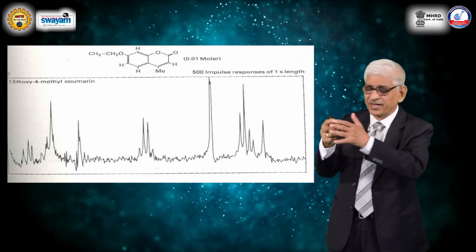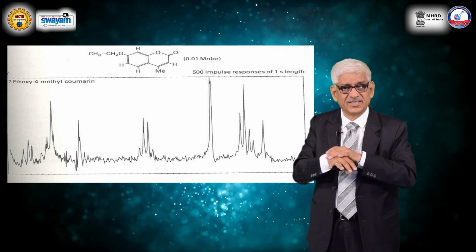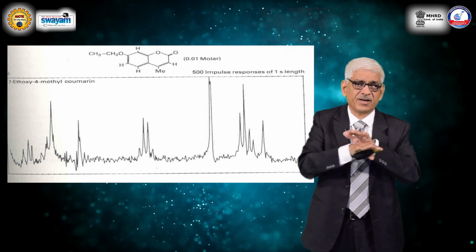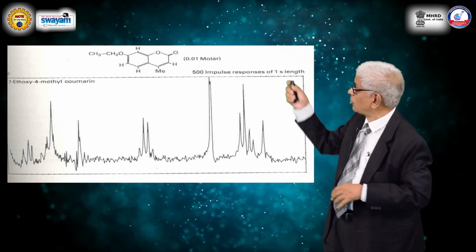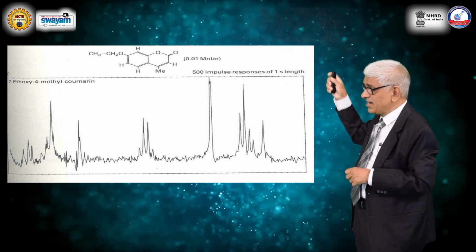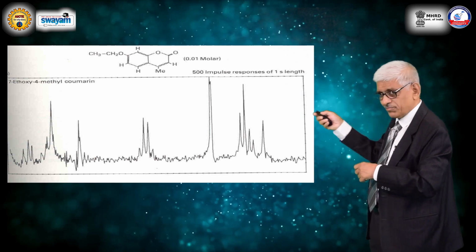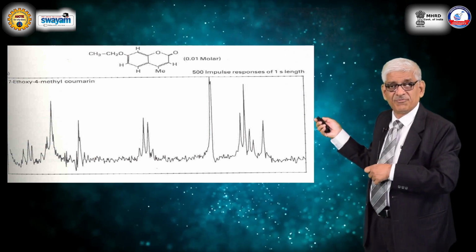See, the bottom spectrum in this is the conventional spectrum recorded on the molecule which is indicated on the top over there, and that is a small organic molecule, and that one gave you a spectrum which is indicated at the bottom trace there, and typically in 500 seconds.